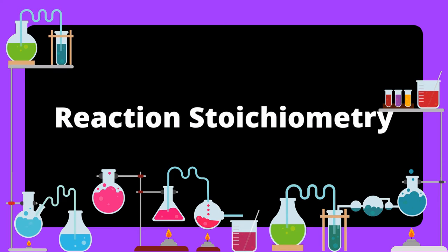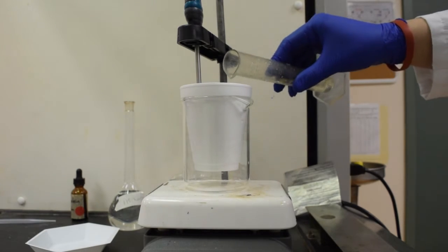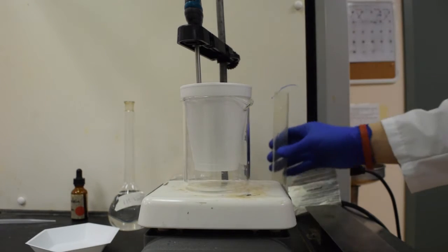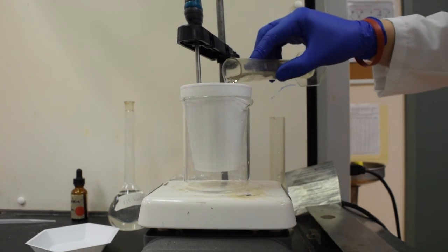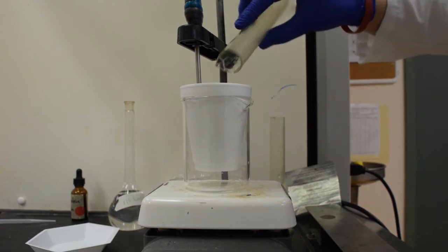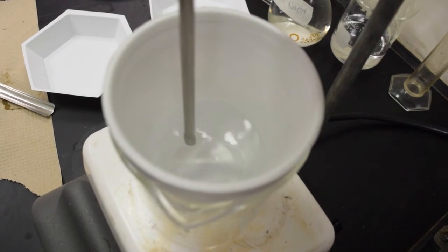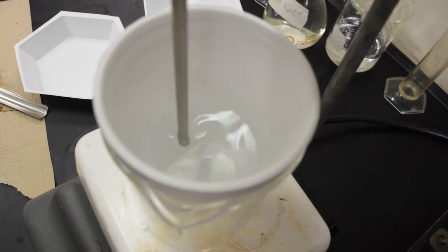In this lab, we're going to take a look at the stoichiometry involved in an acid-base reaction. So here we're pouring an acid solution as well as a base solution together into a styrofoam cup. And what we'll be doing is measuring how the temperature changes based on the volumes of acid and base that are added. Inside the cup, we have a stir bar and a thermometer that is sending temperature data to a computer.